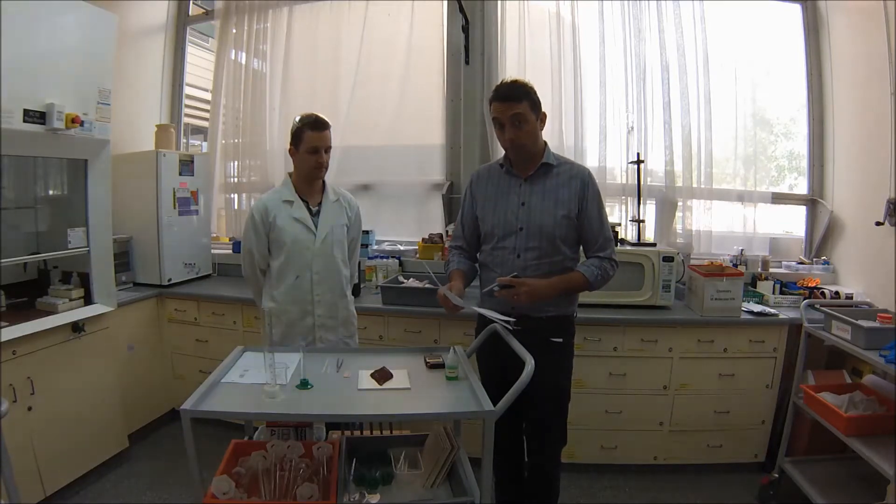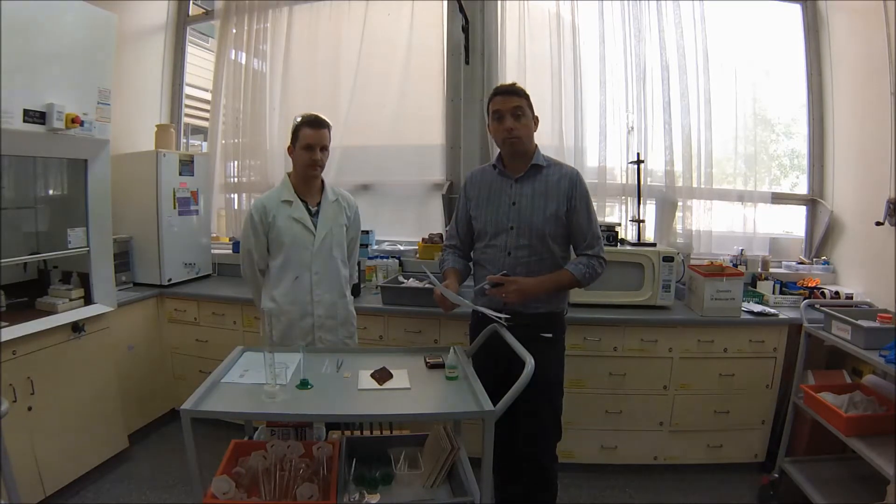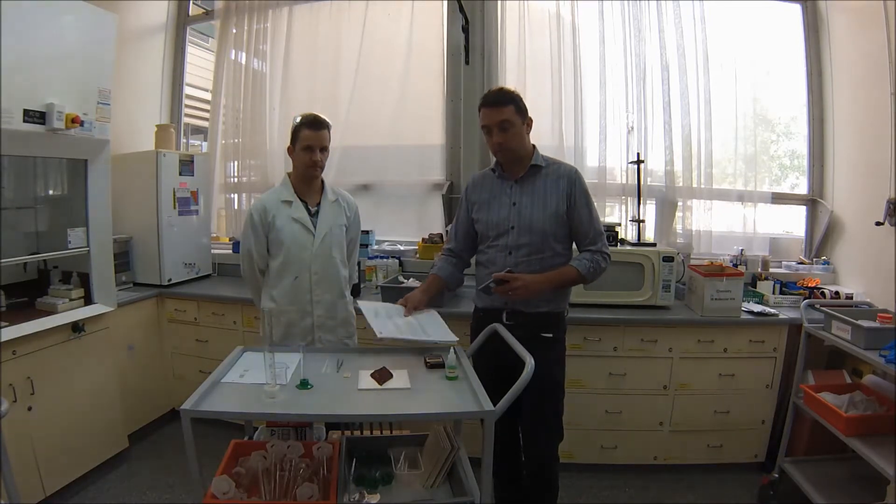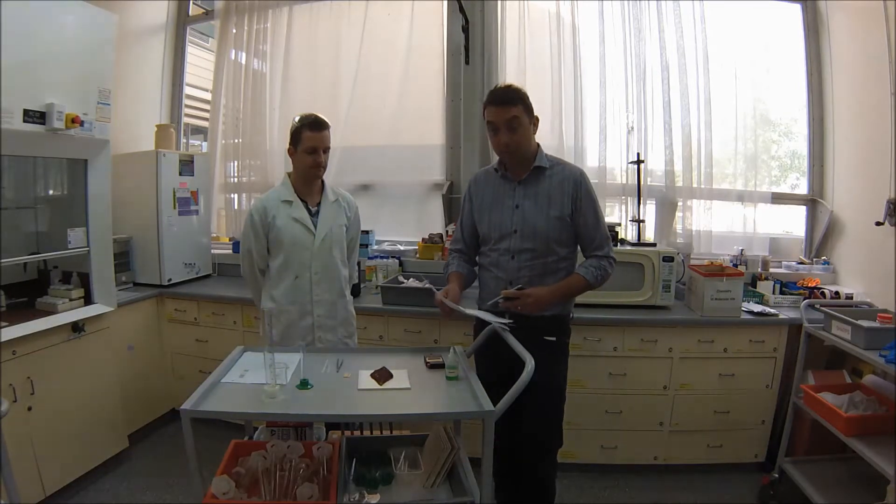In this reaction, hydrogen peroxide is being broken down and oxygen is one of the byproducts. You need to go away and research that reaction, how hydrogen peroxide is broken down or decomposed by the catalase. In this case, the source of catalase is going to be the liver, the enzymes in the liver. So go away and research that reaction because it's volume of gas produced in a minute which we're going to use to equate to a rate of reaction here. So that's some important background information for you to research.